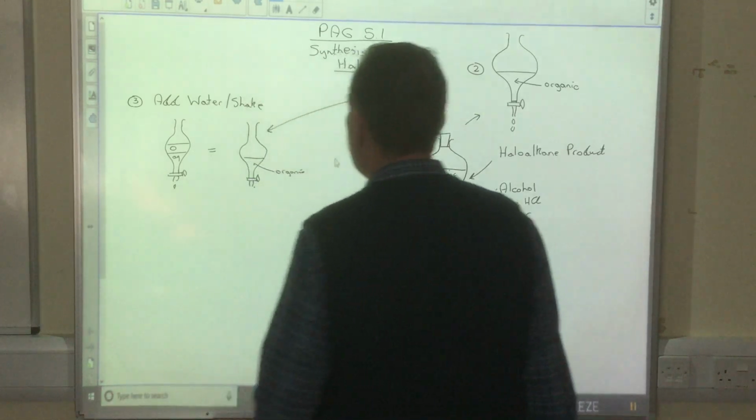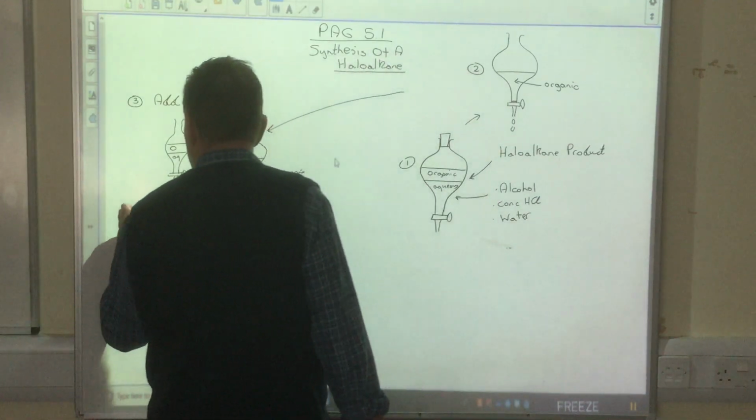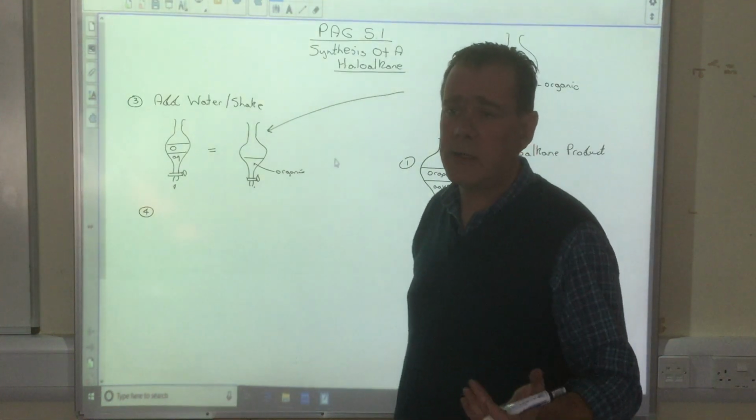Okay, now, there's another thing that you can do to make it absolutely right, because this organic layer will still have unreacted hydrochloric acid in it, okay?